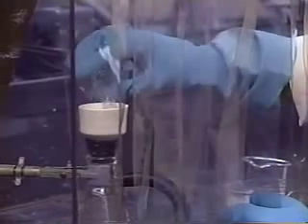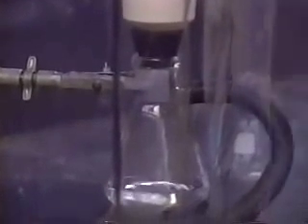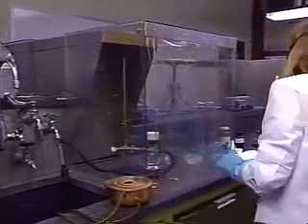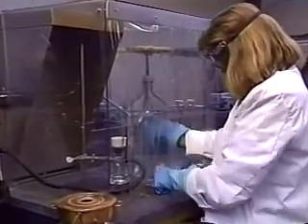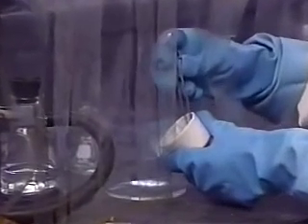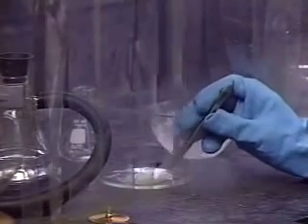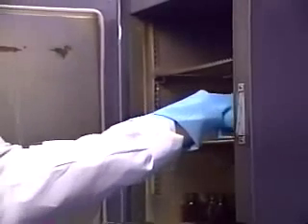The crystals need to dry for a while to remove any solvent which adheres to them. Usually this is done simply by drawing air through them while they remain in the Buchner funnel. Remove the filter paper from the Buchner funnel and transfer the crystals to a watch glass. Sometimes the crystals are dried in an oven after the filtering process.